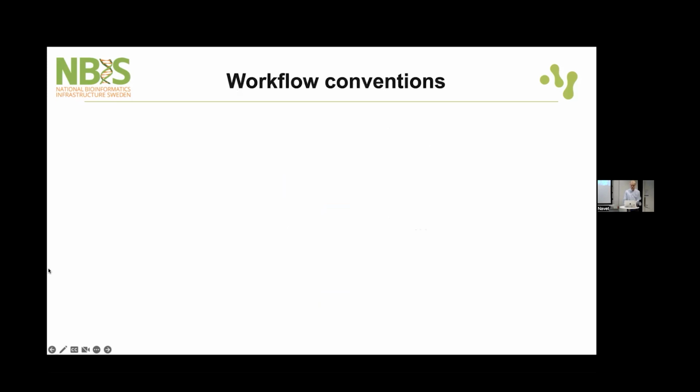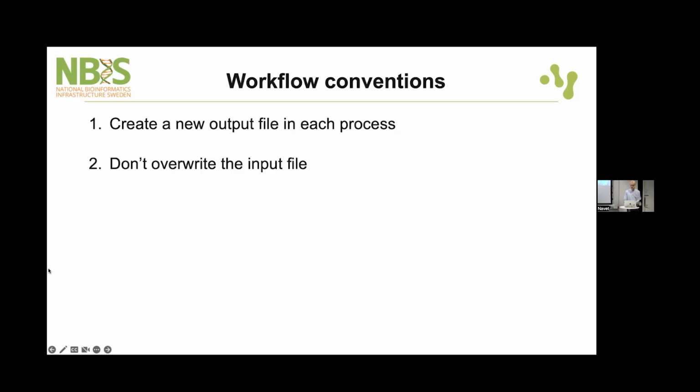Now, for this to work out without more headache than necessary, there are some conventions that I recommend that you follow. First, always create a new output file in each process. Don't overwrite or try to change the input file.